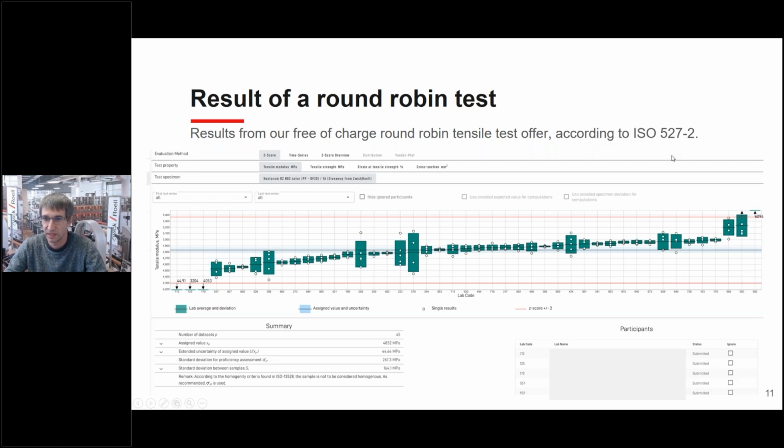So all these things can go wrong, and we've seen them here, but the nice thing is that over 90% of the customers did a nicely performing job. So this is what you can learn from these values. And in labXplore, it's a little bit interactive. Here in the screenshot, you can see it. You get information about the average and the assigned values. You can play around a little bit. I will show you this later on by excluding, for example, a data set. So you can play a little bit with what if a data set is not part of the data. So it's a little bit of simple interactive statistics.